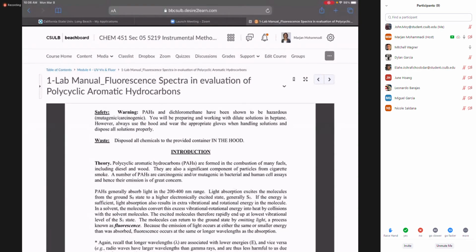So the major part is going to be fluorescence for this one. You know the story behind the fluorescence, so I'm going to leave that part for your class. Just briefly, we are going to make molecules excited. They are going to go to another electronic state, and then when they are coming back, they are going to give us the fluorescence peak. Of course, in the middle, we have rotational and vibrational states, so part of the energy is going to be converted to those.